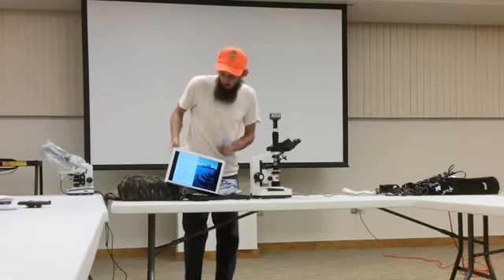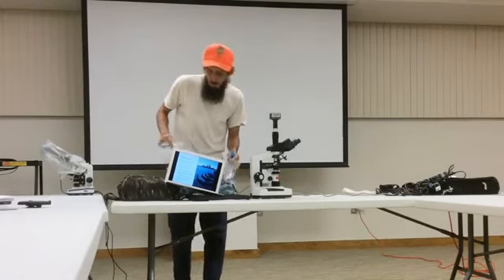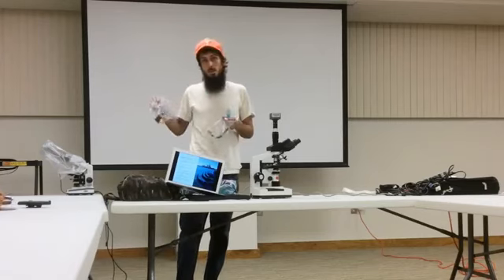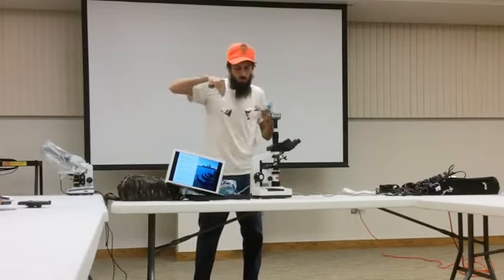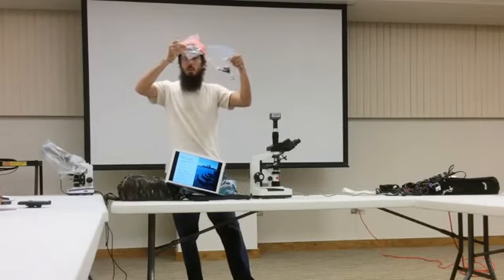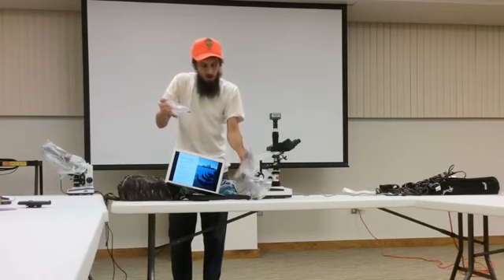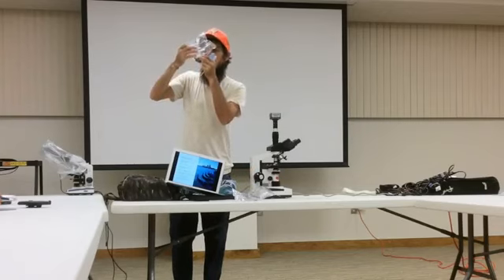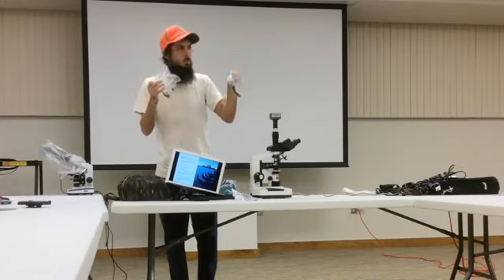So what I'm gonna do here is prepare my slide, and I want to be somewhat scientific with this and be consistent, because if I prepare slides differently, I'll get different results. But this is a pretty consistent way to prepare slides that I'm going to share with you. I have 3 different samples here. One is from an IMO pile, this one. This one is from my garden outside, and this one is from another part of my garden where the plants are all looking really healthy.